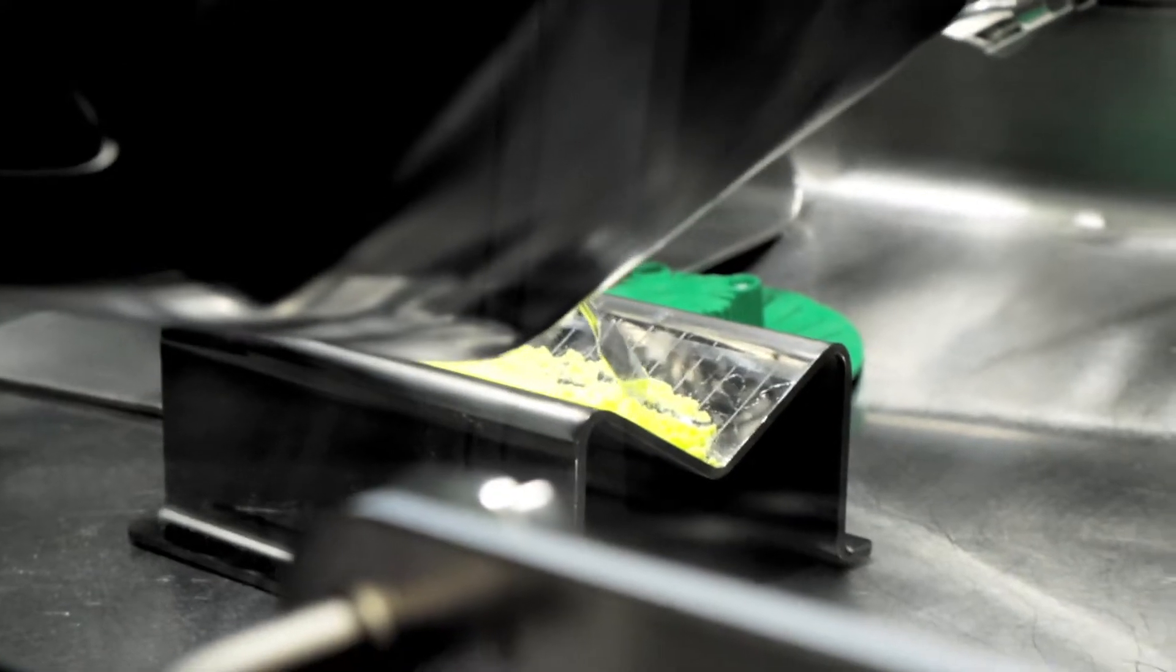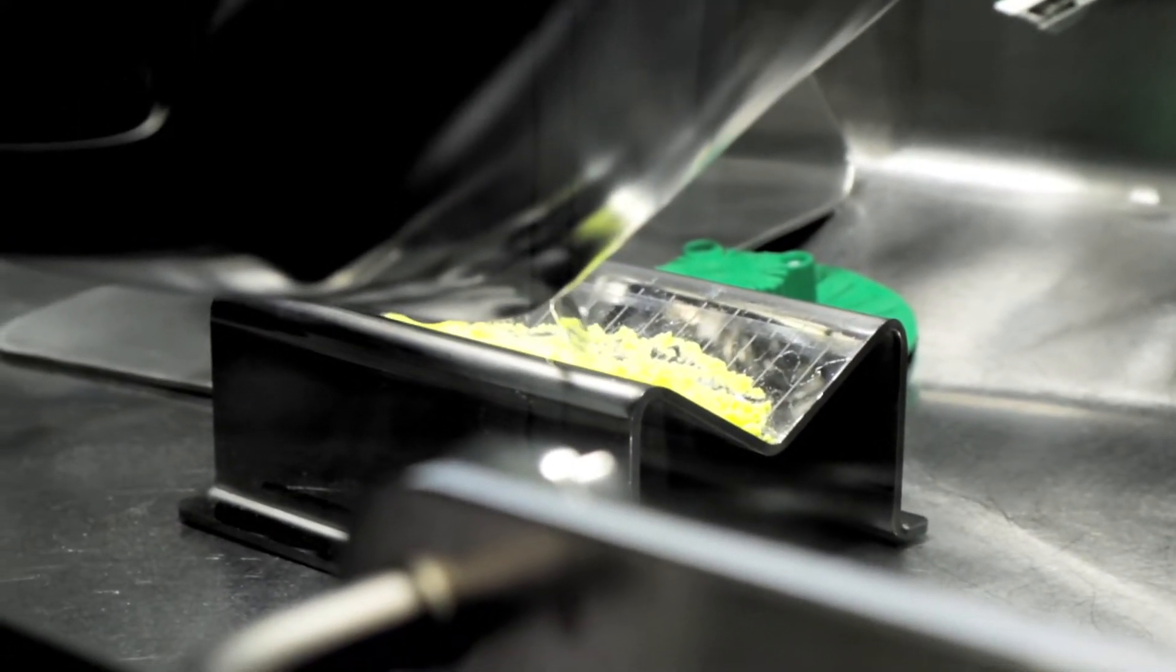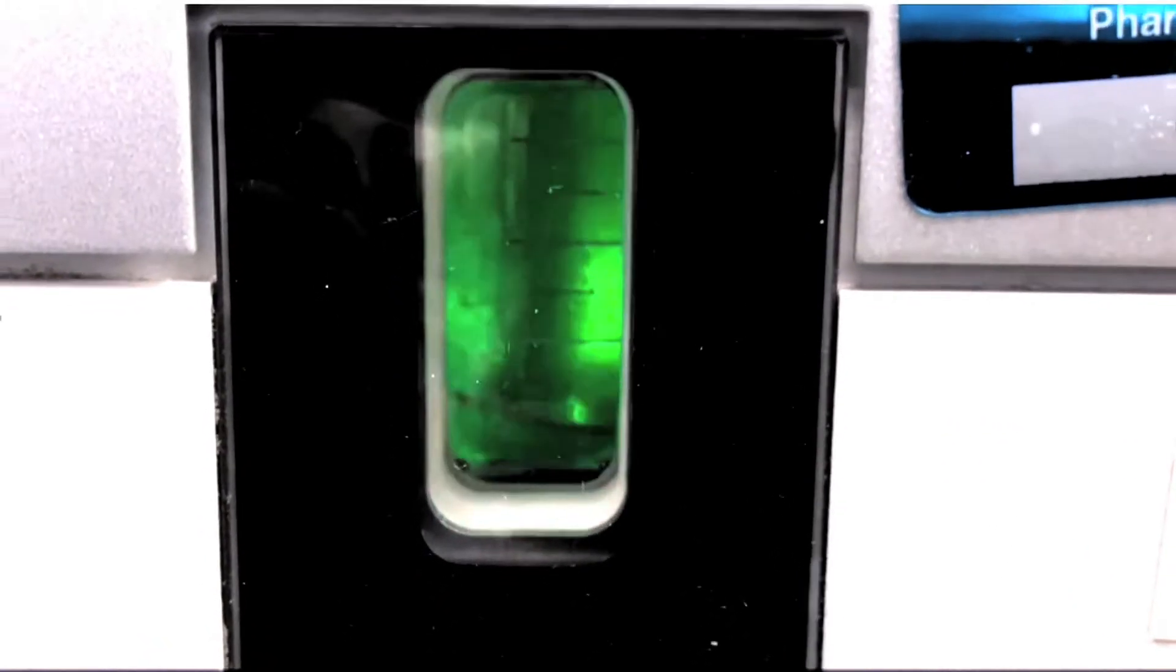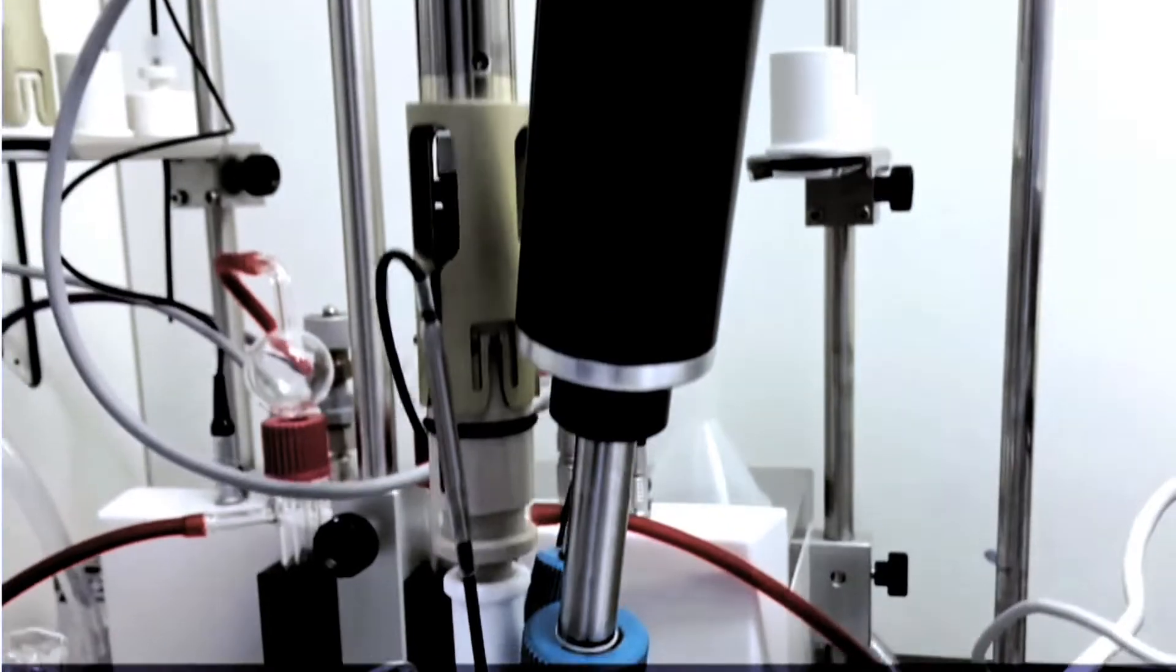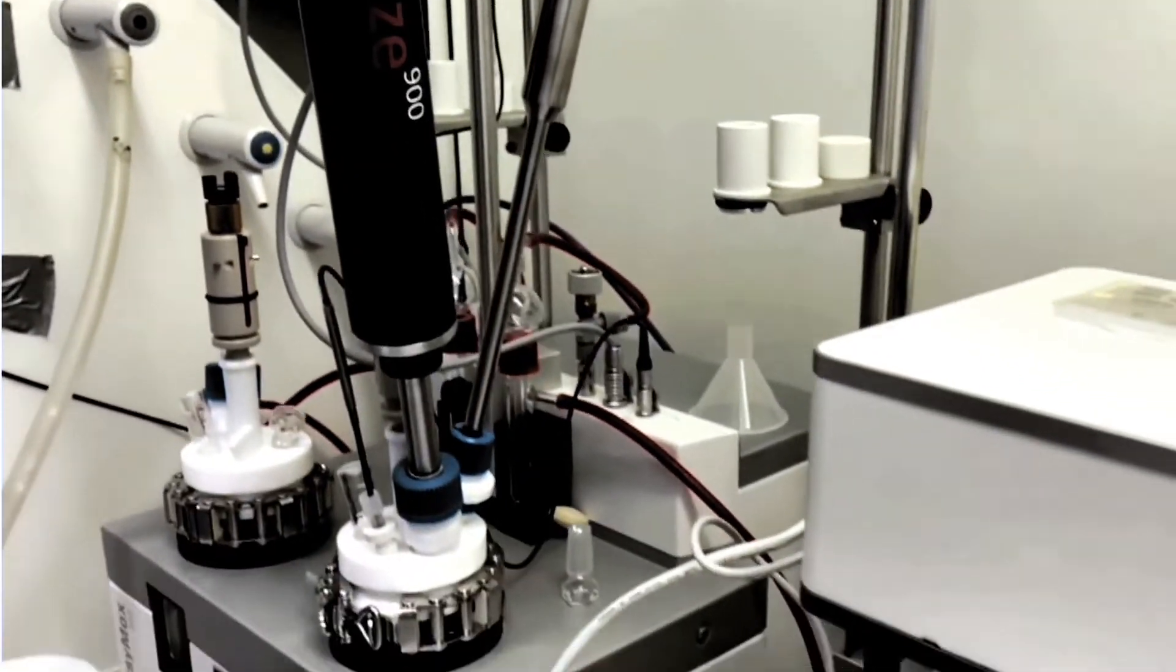We can also generate micronised samples for use as seed crystals for solution-based crystallisations. Use of well-defined seed material is critical in the design of a well-controlled and robust crystallisation process.